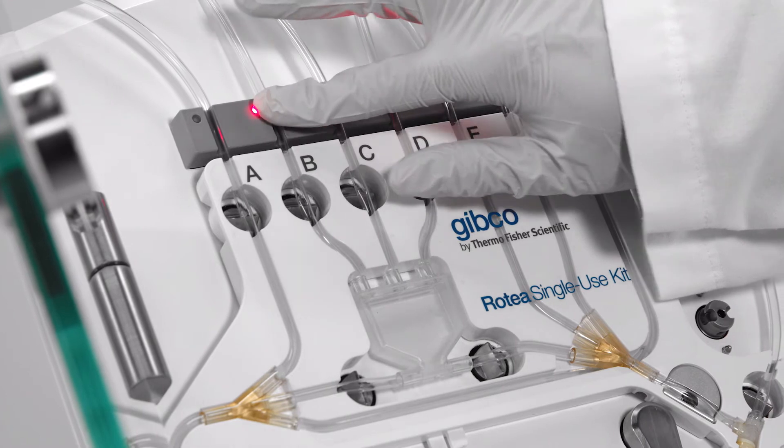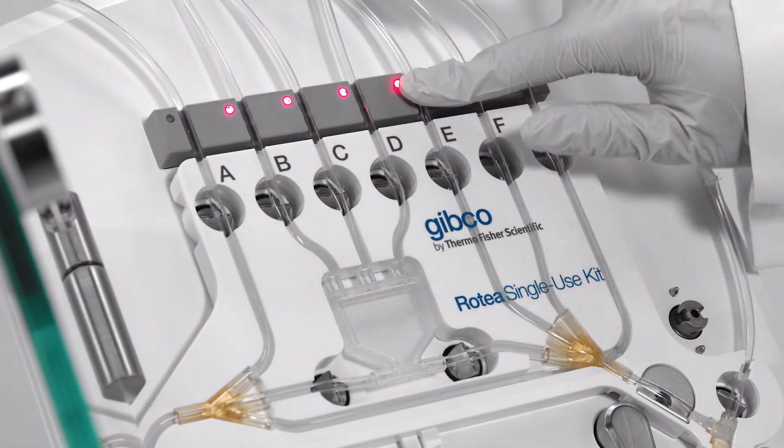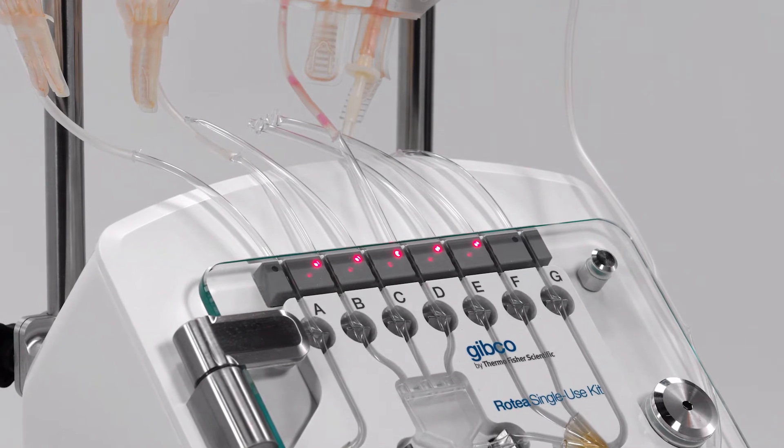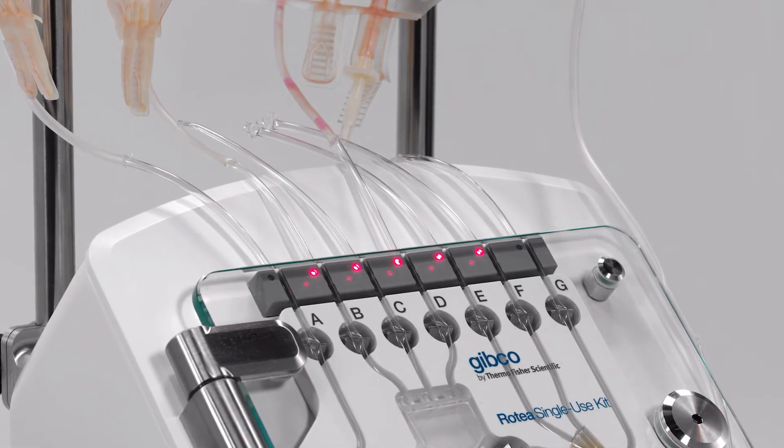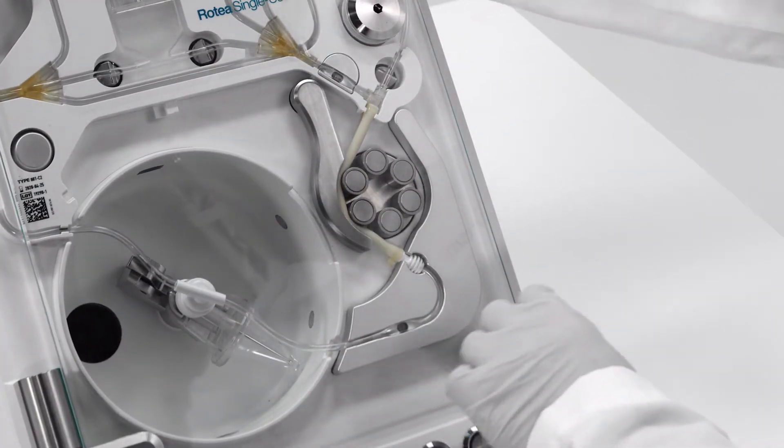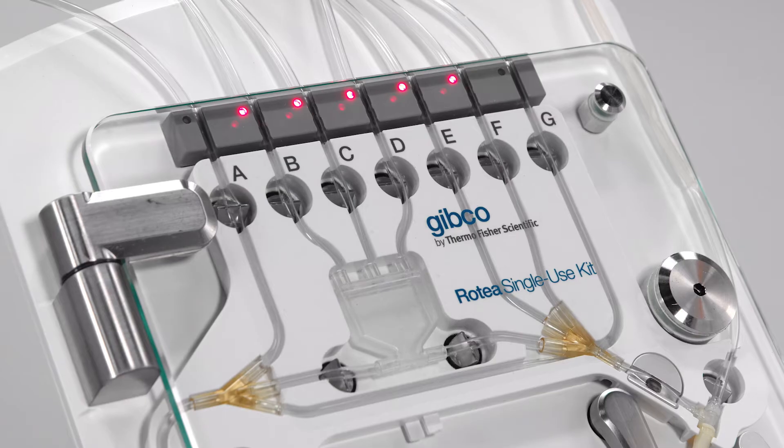Press the tubing from each port on the kit into the tracks along the bubble sensor strip. Make sure the bags aren't tangled so you can easily follow the protocol progress. Lastly, close the door by pressing down on the door latch. The pump clamp will close, the cone will spin, and the valves will close.